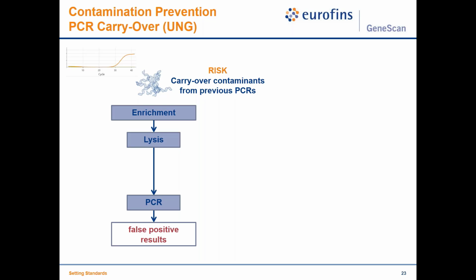So of course, this will normally never get into your lab because the PCR tubes stay closed, but accidents do happen from time to time. I've been in technical support for some time before I joined Eurofins, and I have seen it more than once that there's actually a contamination due to an accident or due to really wrong handling of the tubes. So there is a risk that you actually contaminate your lab with these PCR amplicons and get a false positive result, as you can see on the left side.